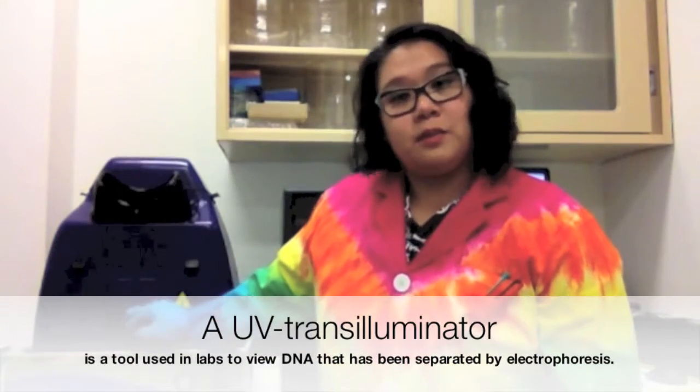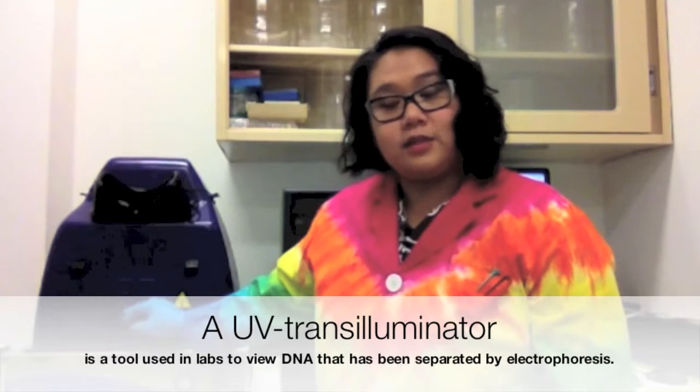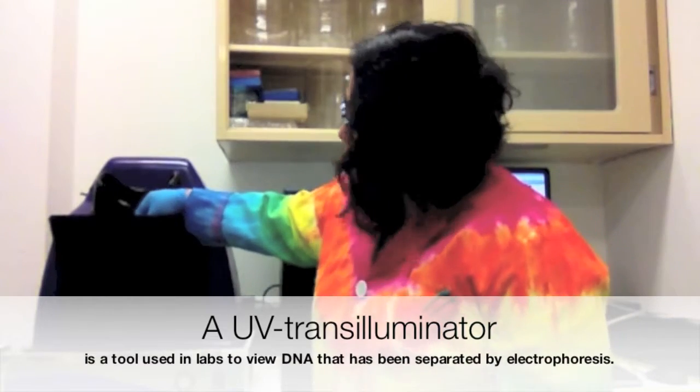So now we're done running our gel. And just like you would develop film in a dark room, we're going to develop our gel in our little dark room. This is called a UV transilluminator, and it emits UV light, and this allows us to see if the DNA in the gel actually moved and how far. So we're going to put it in this little cabinet, and then we're going to turn on the UV light.